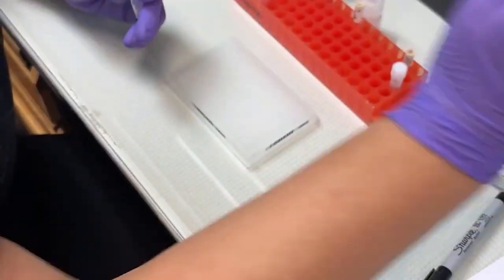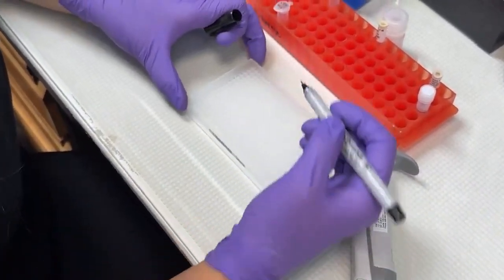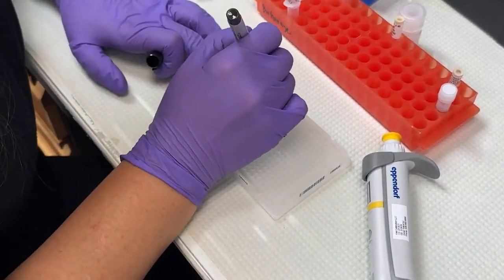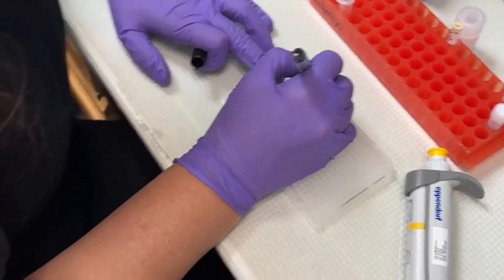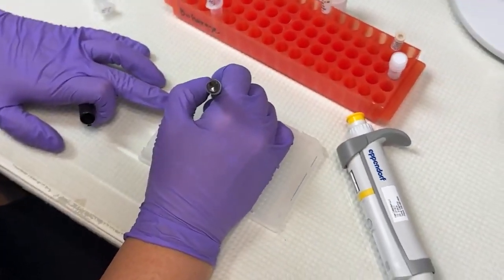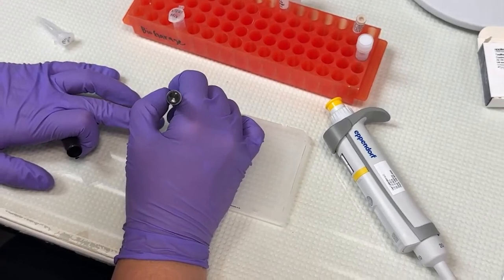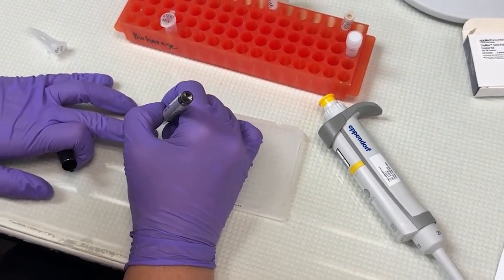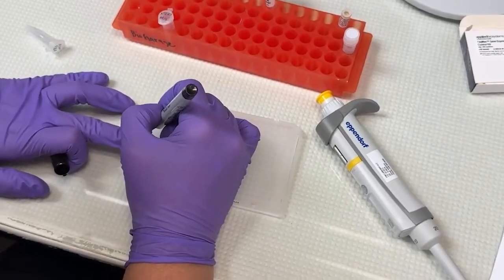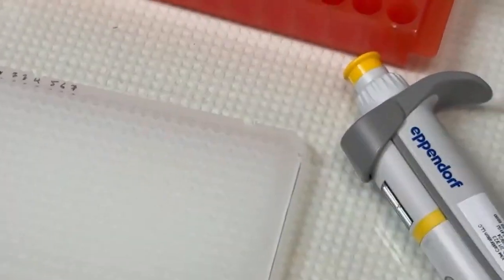Everybody's looking at white on white, and even I am having trouble seeing what's going on. So I'm going to make some marks so we can track ourselves: 1, 2, and 3, and then 4, 5, 6, and 7, and then A, B, C, D, E, F, G, and H. Hopefully that's a little better to see now.